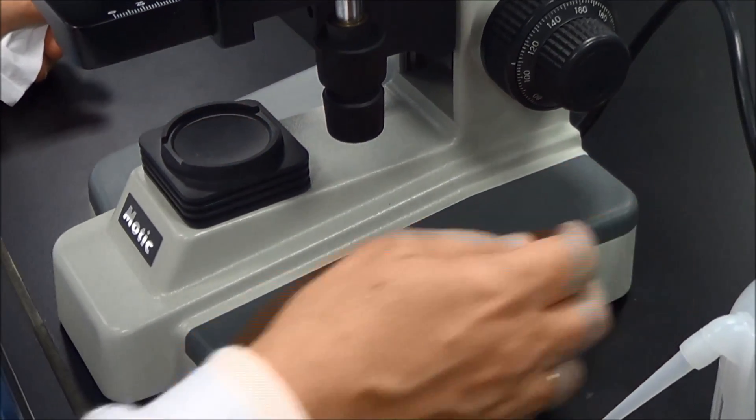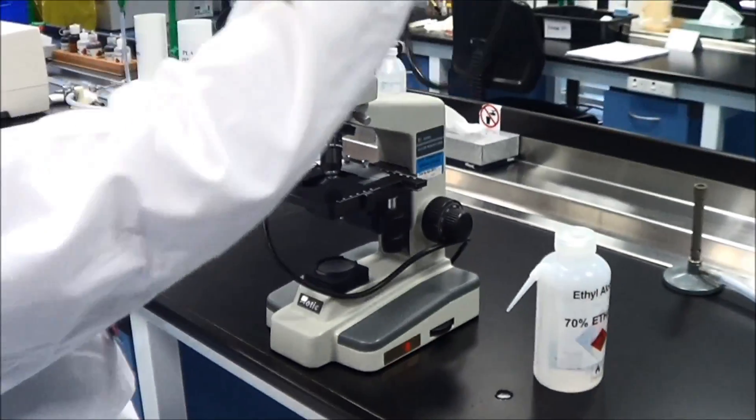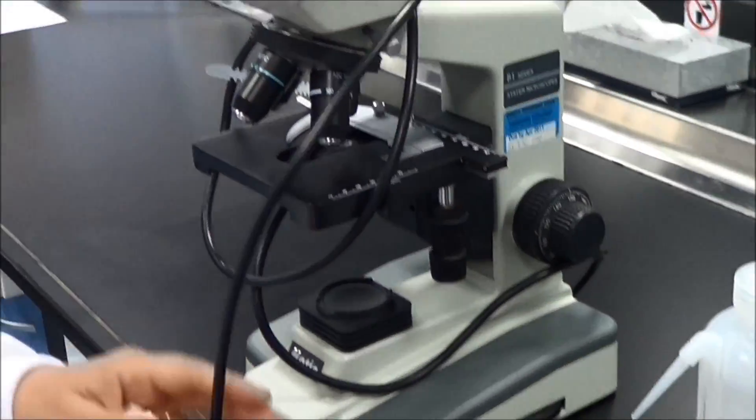To pack away the microscope, turn off the light, loosely wind the power cord around the microscope, replace the cover and put it carefully back into the cupboard.